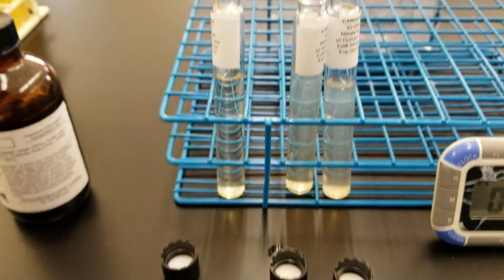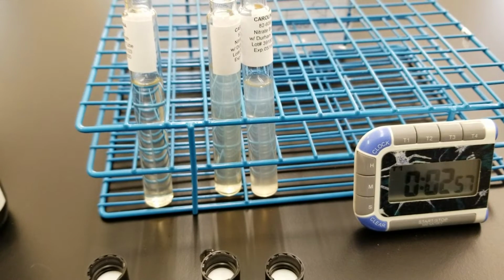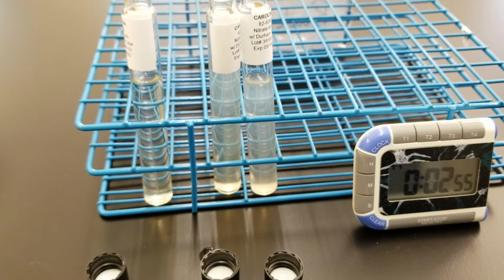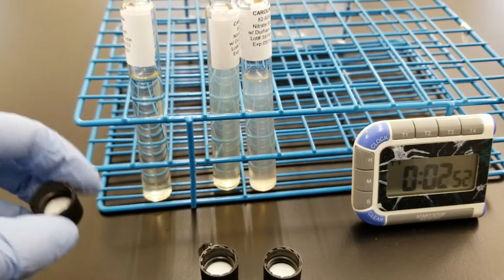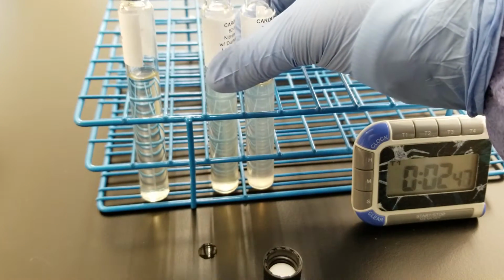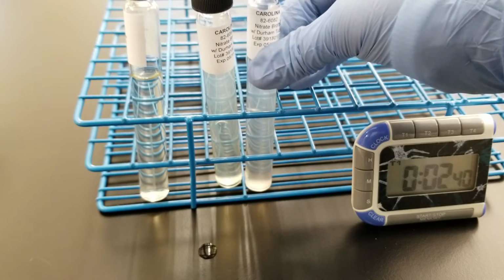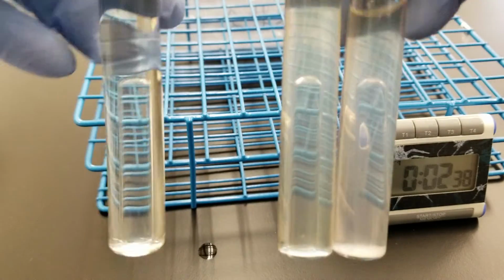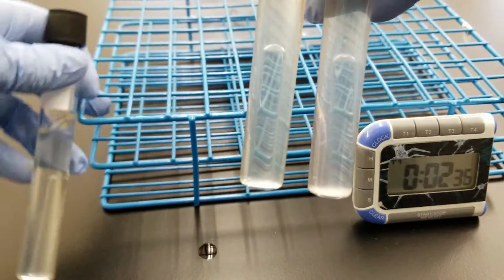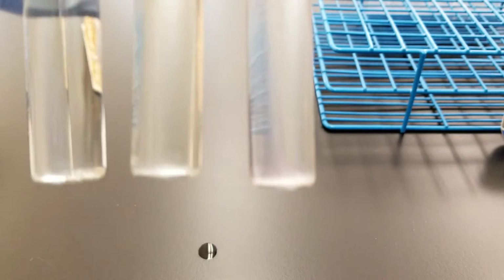And we're going to set the timer to start going and look for a color change. I'm going to recap while we're sitting here. Okay, so let's look so far. So far, do you see any difference?